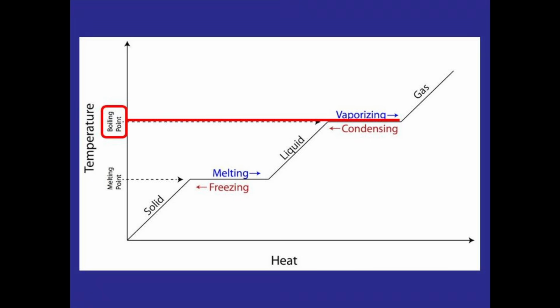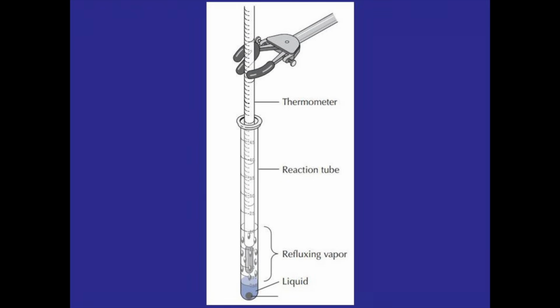That boiling point can be a little inaccurate for a variety of reasons. One, the atmospheric pressure is going to be slightly lower at a higher elevation, so we can already expect the boiling point to be a few degrees lower than the literature value. And two, that boiling point can be off depending on how close the thermometer is to the boiling liquid. We want it just a few millimeters above so that it measures the temperature of the vapors before they have too much time to cool off.